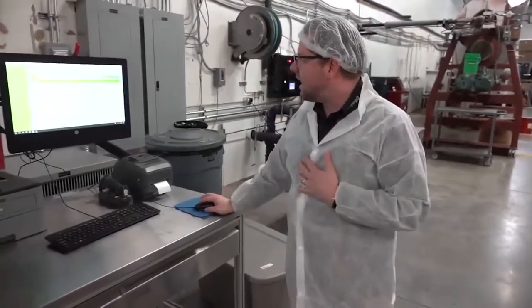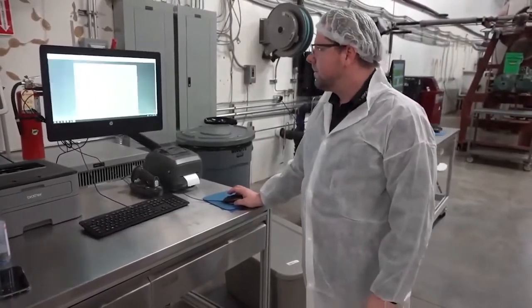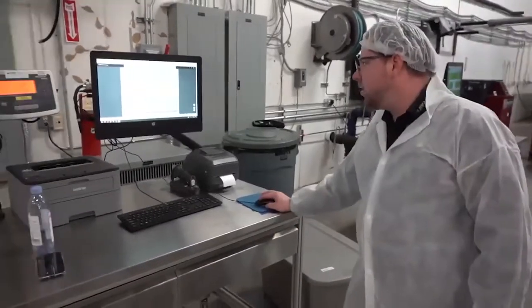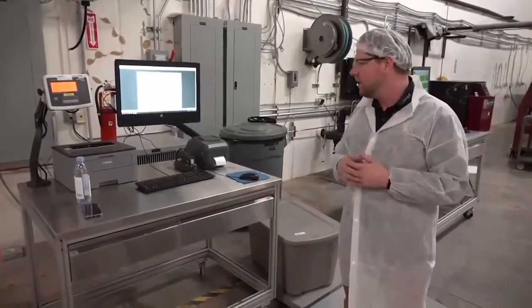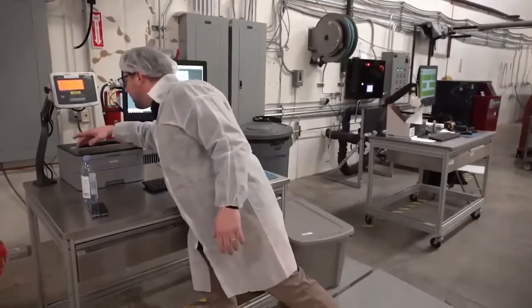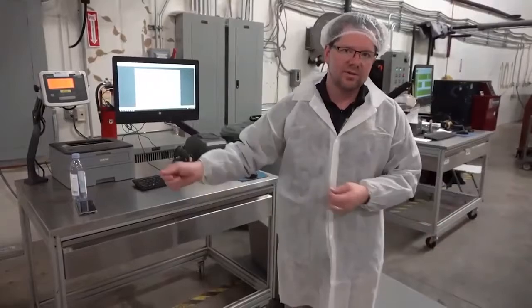Once I close that lot, I'm gonna download the receipt, and then I will print this receipt. So the receipt can go with this, or it can go into your quality system, or it can go into a notebook. What's nice about that is it's got a receipt. It prints out, and you're able to really use that as a traveler as it goes through the system.